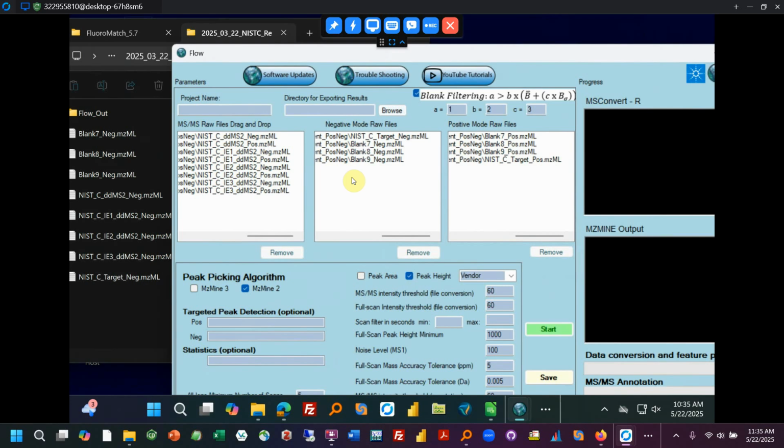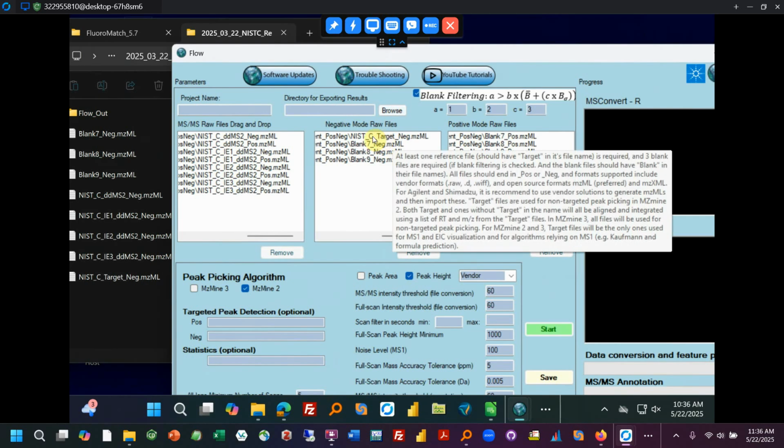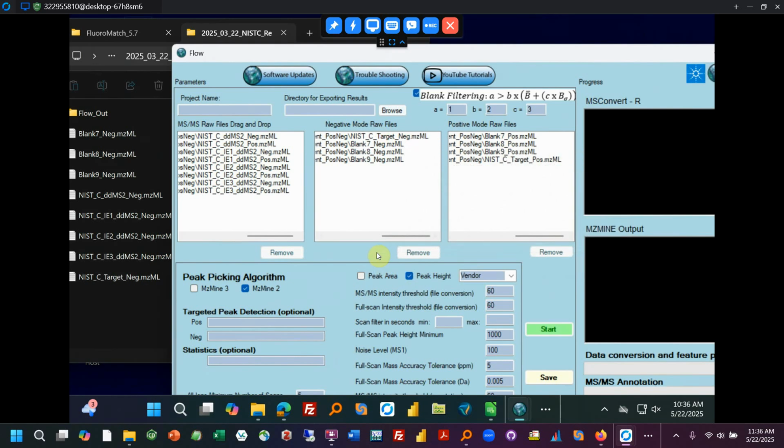And so we recommend just a few reference samples. So if you only have 5 samples, you could call them all targets. Again, we're calling targets synonymous with reference samples. If you had 100 samples, I might go up to 15 targets the most. Lastly, when you're doing blank filtering, these are the ones that it's going to be used that have to be above your blank filtering threshold.